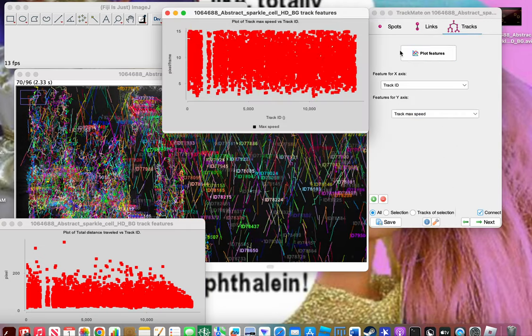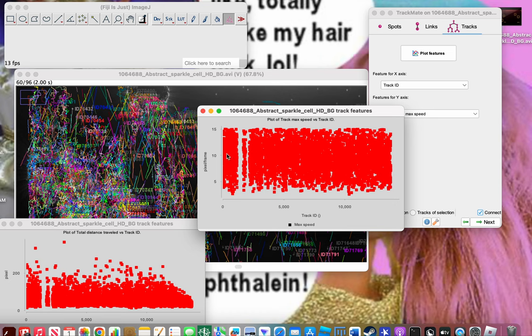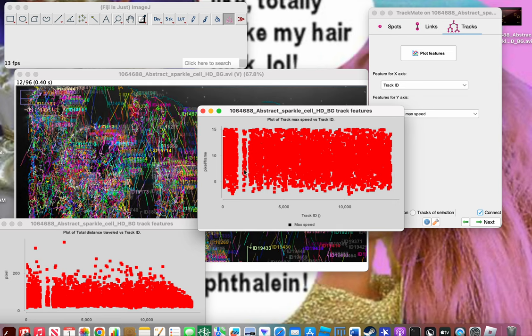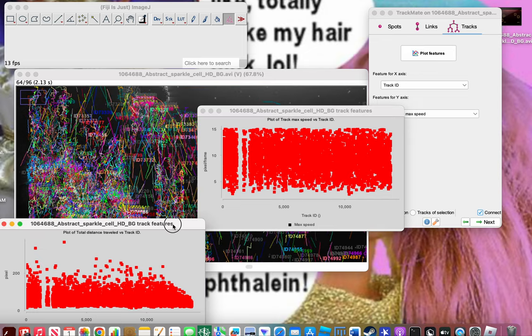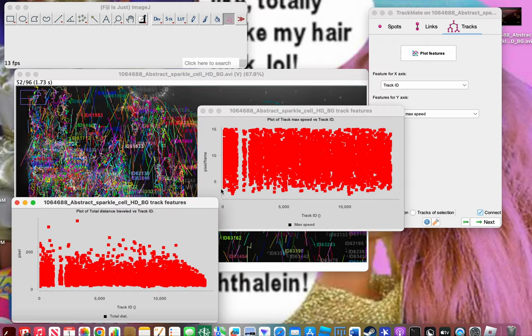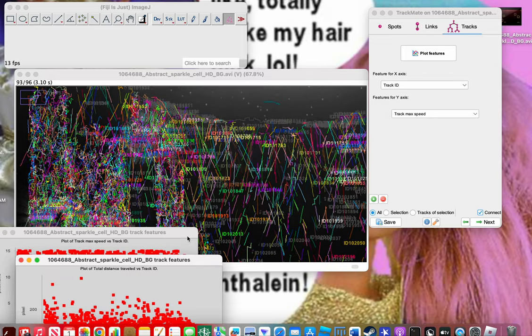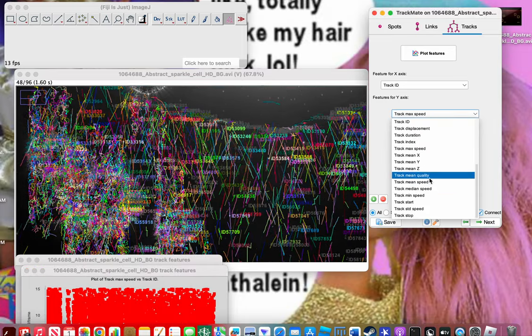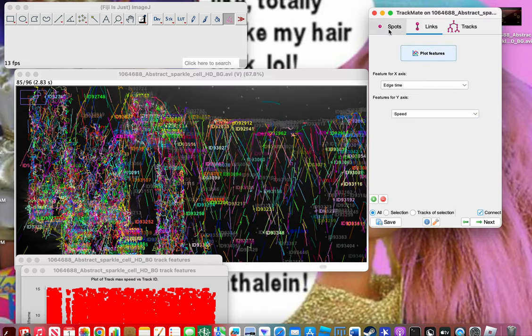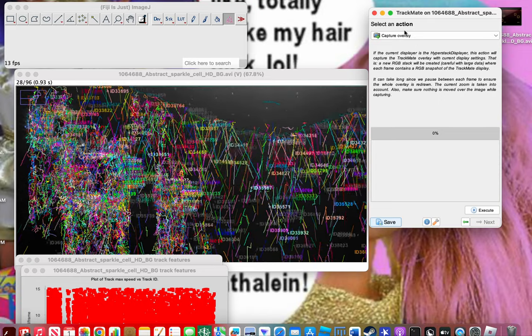You can also plot track max speed. As you can see, the speed ranges from around two pixels per frame to 15 pixels per frame — it looks pretty evenly spread out with some weird streaks that keep appearing. There are a lot of options here and it really helps for analysis of your data. The same goes for links and spots — it really helps for analyzing your data.